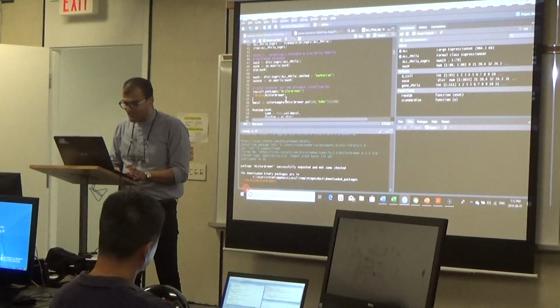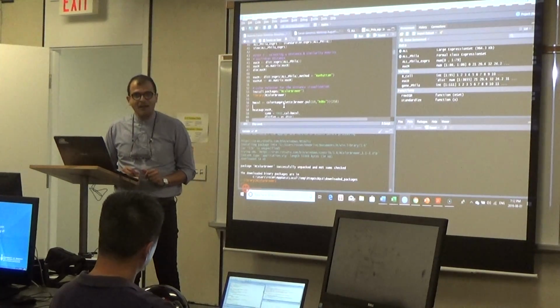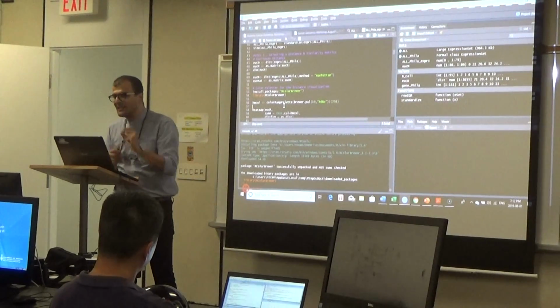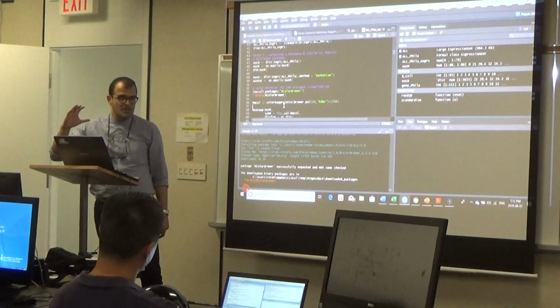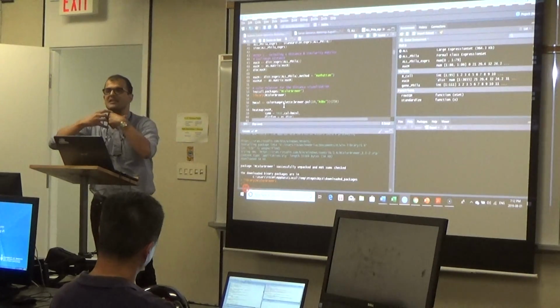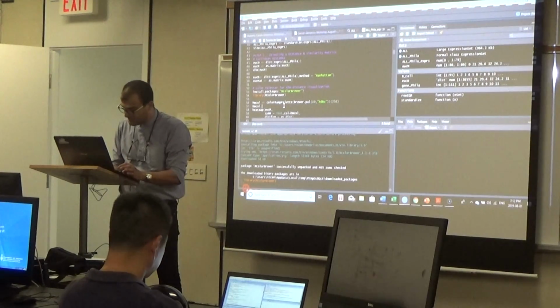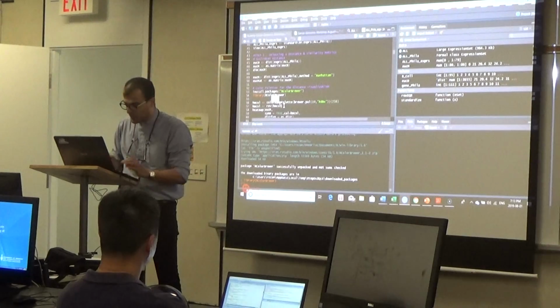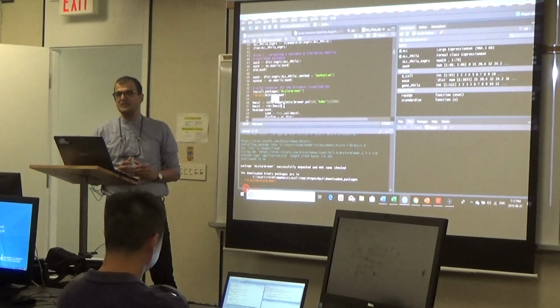But the problem is that the palette in R is designed in a way that the higher intensity is shown by blue and the lower intensity is shown by red. We want it to be different. We want higher intensity to be red. That's what I do. I go to the HMCol and use the function rev, which stands for reverse.